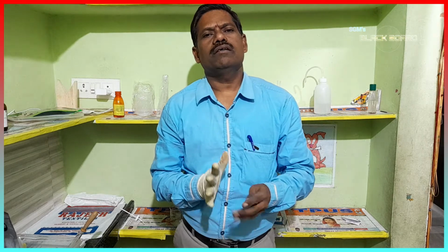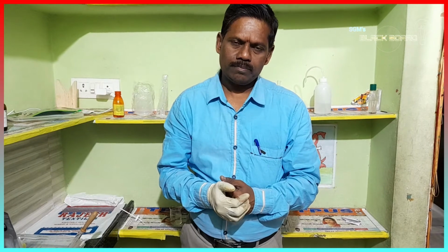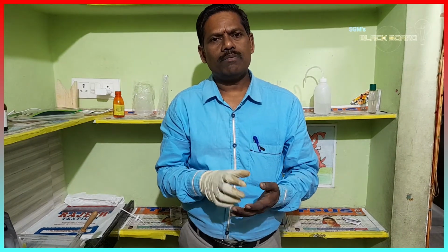In the previous activity, we have seen that HCl behaves as a good conductor of electricity because HCl produces H plus ions in aqueous solutions. Does this mean acids produce H plus ions only in water? Let us see by doing a small activity.